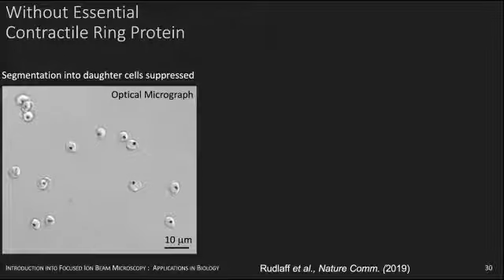So as nice as it is to have now a three-dimensional view, the key interest is still to understand what the proteins are doing. That is the power of fluorescence microscopy, and there is an approach similar to fluorescence tagging, as Nikki explained in her talk, by using immuno-labeling with gold particles.